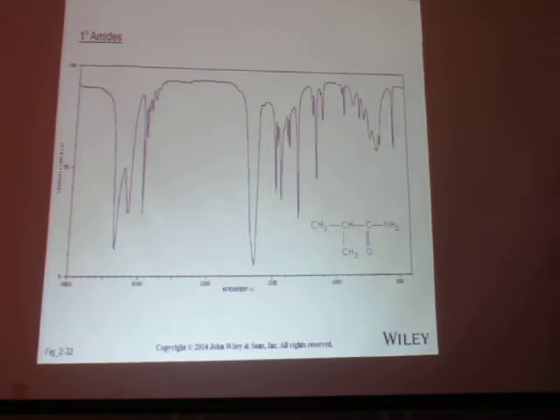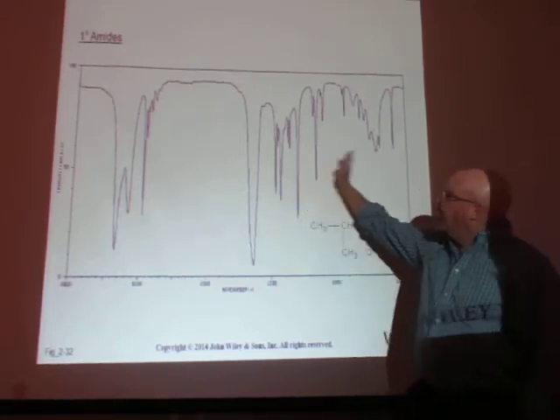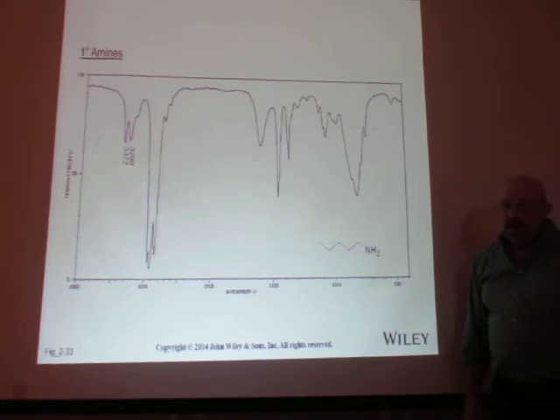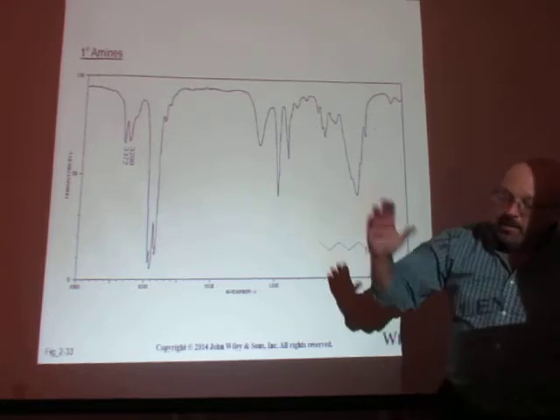Questions on that? Everything else here was 1500 and below, fingerprint, not of concern. Next you're going to look at a primary amine. And we just went through the amides.